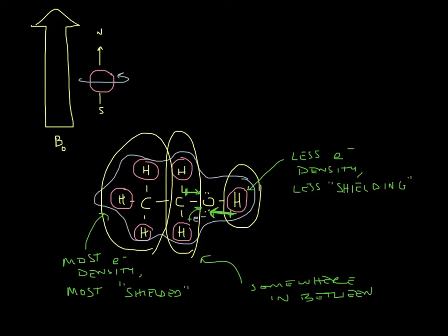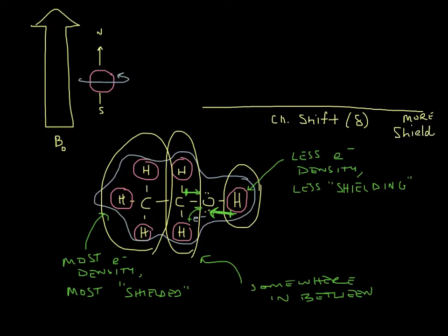All right. When you put this molecule into an NMR, you would get three different signals on a spectrum that looks roughly like this. The scale of this is ppm. We call this the chemical shift, and we label it with a little tiny delta. Delta means change, and we see this as a change from a standard that we put in. On the far right side, we would have the more shielded protons, and on the left side, we would have the ones that are less shielded.